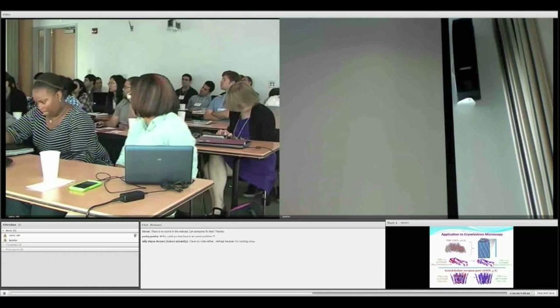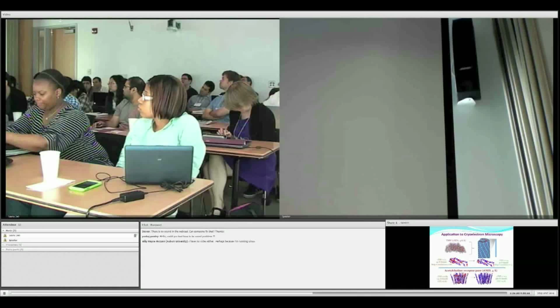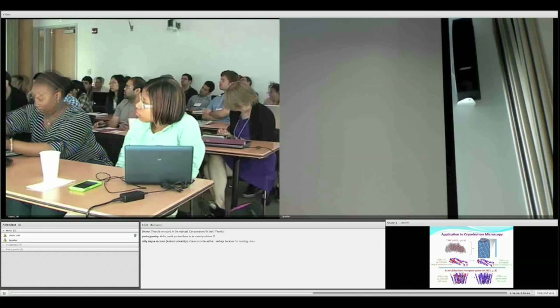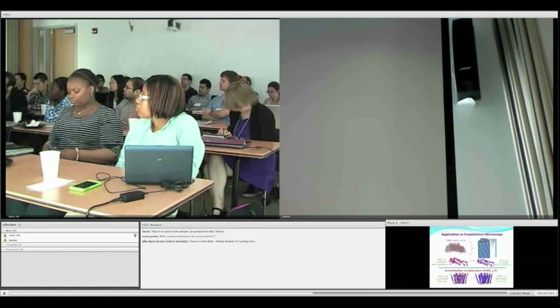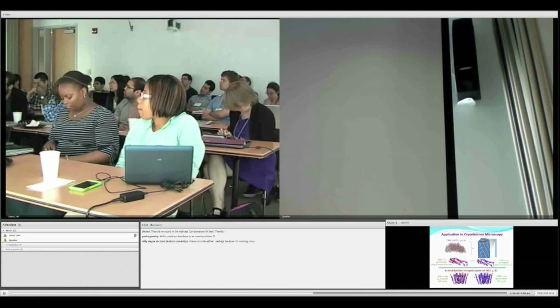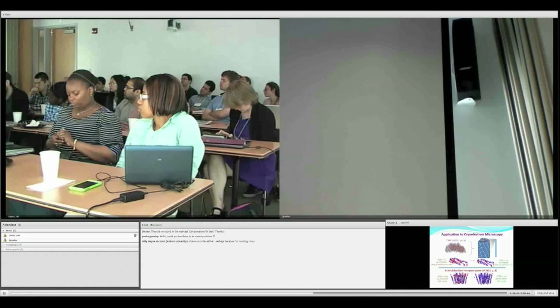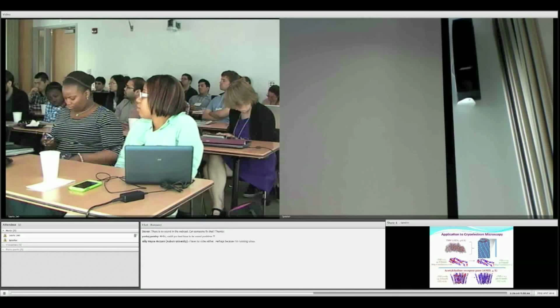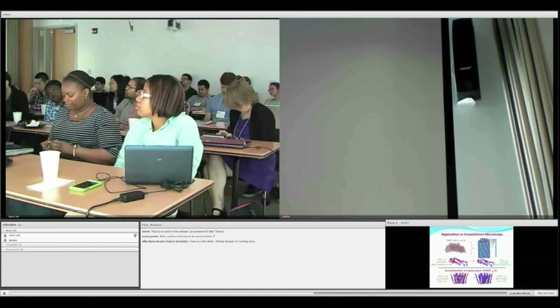Yes. Well, for the cryo-EM, there is a density, okay? But for NMR, this is a work in progress that we are working on right now. There are NMR restraints, like NOE and so on. So there are programs, similar to this flexible fitting, that can be applied after the backbone improvement. So backbone improvement would be pretty much the same.